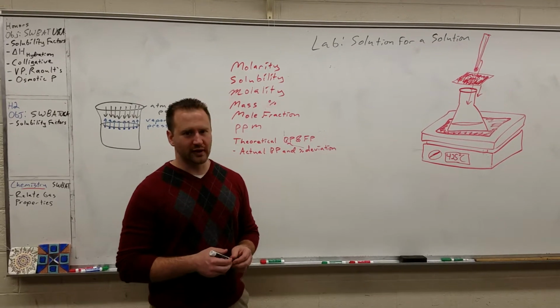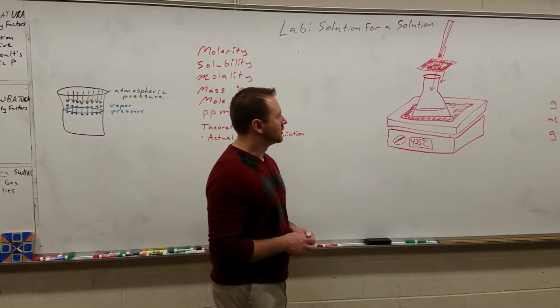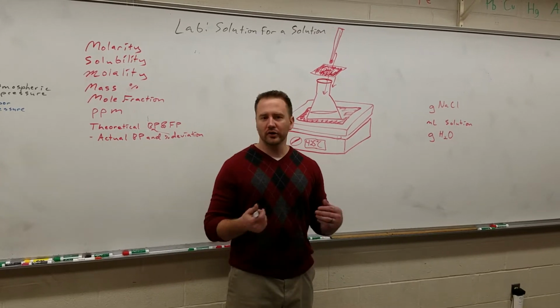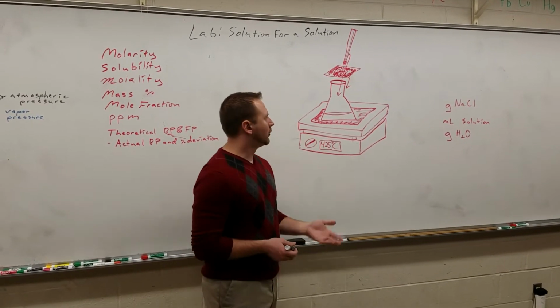Solution for a solution lab. What you're going to do in this lab is take a saturated saltwater solution and analyze its composition. You're going to be essentially looking to find the grams of salt present, the volume of the solution, and the mass of solvent or water that's present. And you're going to do that by boiling it.